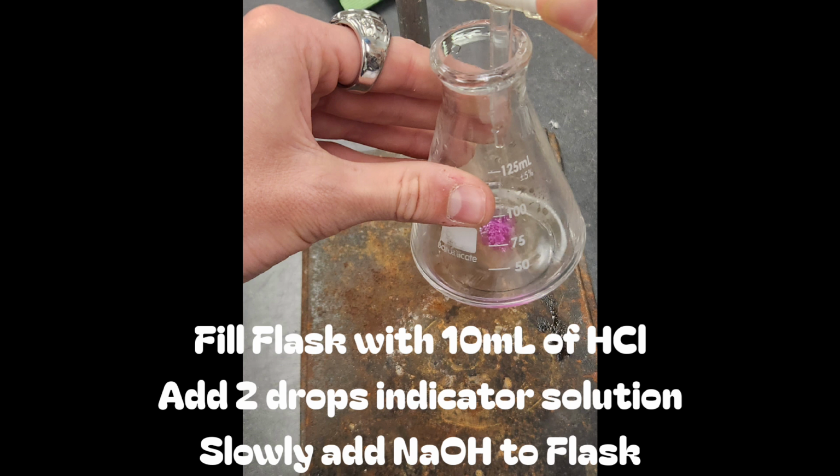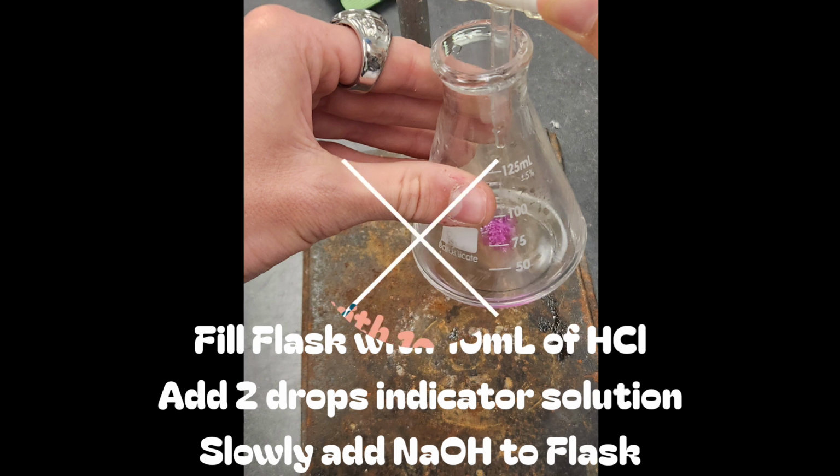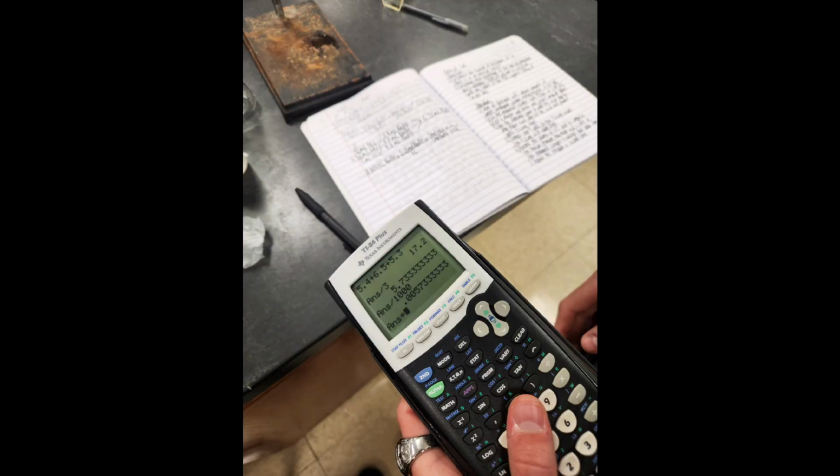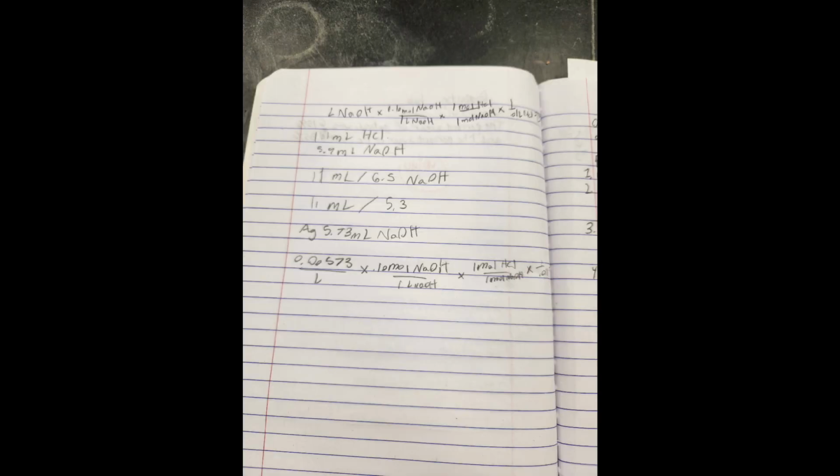Now you will slowly run the sodium hydroxide solution into the flask while swirling. When the solution starts to turn pink for a longer period of time, you need to slow the drops to a rate of about 1 drop at a time. You are finished when 1 drop causes the solution to turn pink and stay pink. You will then average those volumes together so that you can get a more accurate comparison and a more accurate data set. In our experiment, we ended up using 11 milliliters of HCl per trial.